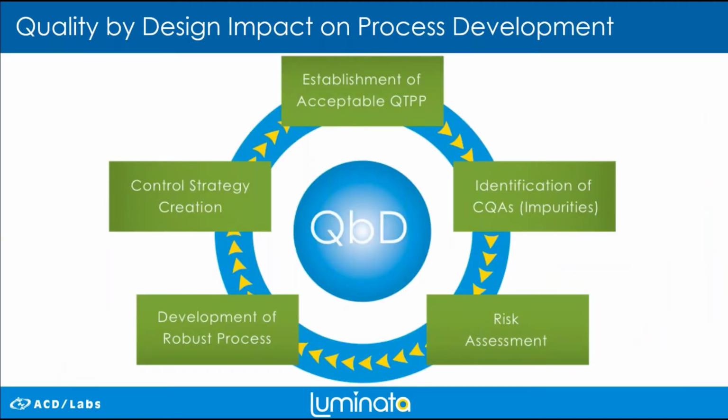Now, from there, quality by design has had a great impact on process development, specifically in establishing acceptable quality target product profiling. And this is crucial to identifying all types of impurities or your critical quality attributes. And from there, really having risk assessments to have a robust process to create those control strategies. Now, the big thing to get out of this slide is you're obtaining more data. So by obtaining more data, how are you analyzing this? And again, interpreting, where are you storing it?